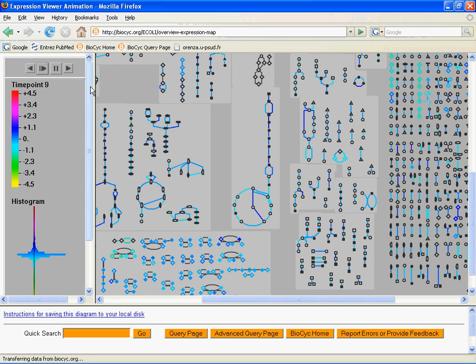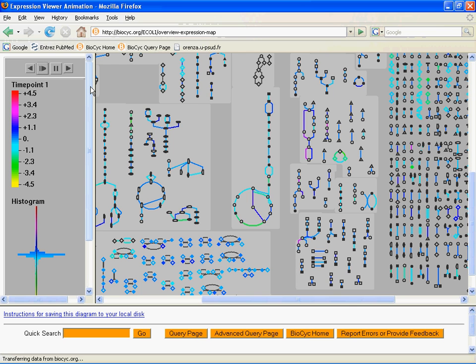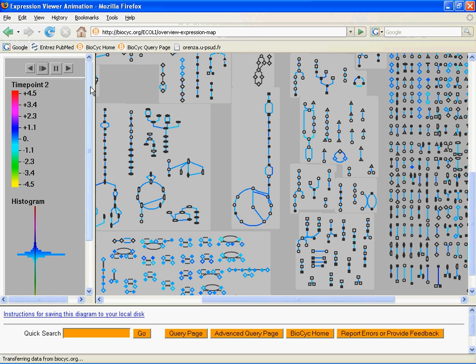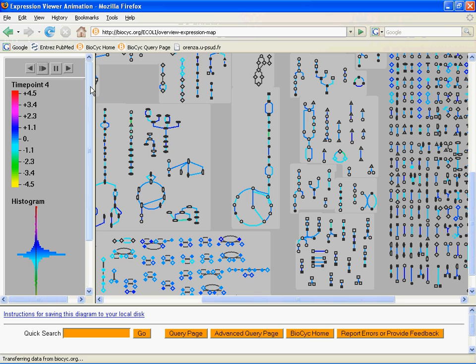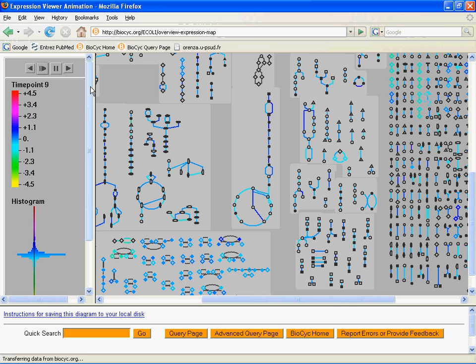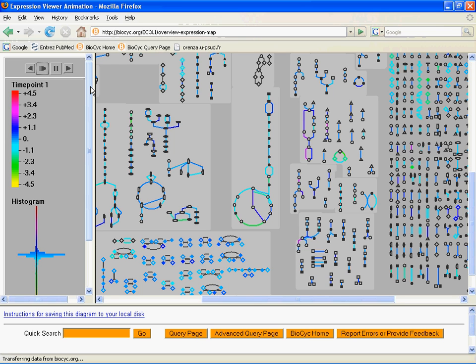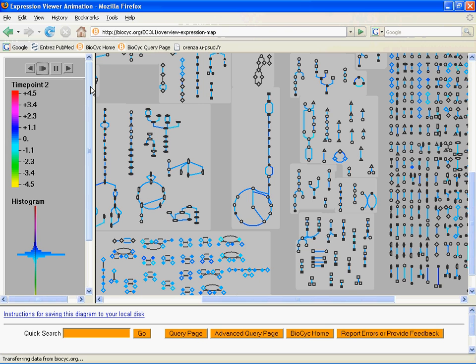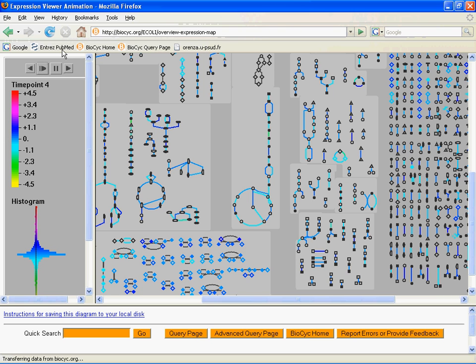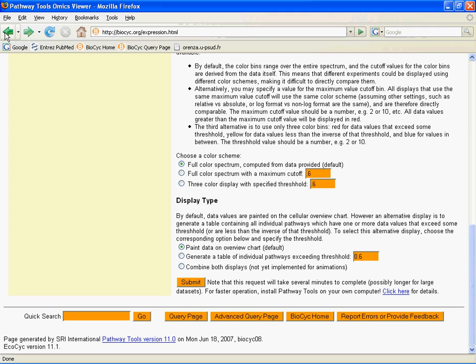Okay, so now we've looked at the same gene expression results set at single time points using the default colors, a single time point using color cutoffs, a single time point using a three-color display, and now we've looked at an animation. And we've also shown you how you can make a chart of tables. So now let's go back to the query page, and we're going to do one more thing, and that's we're going to change up data files.